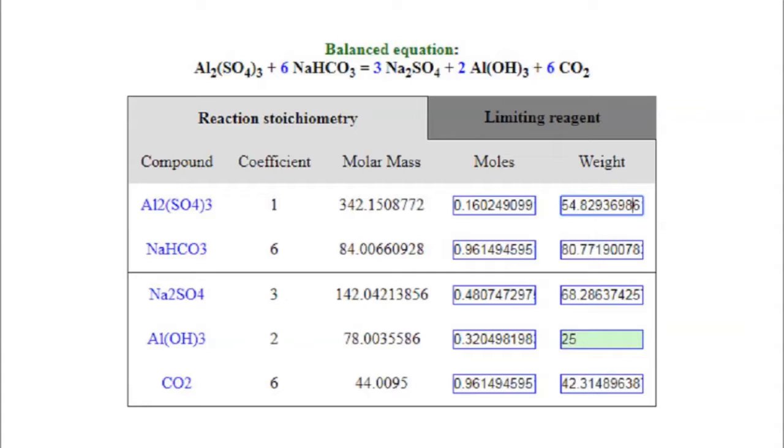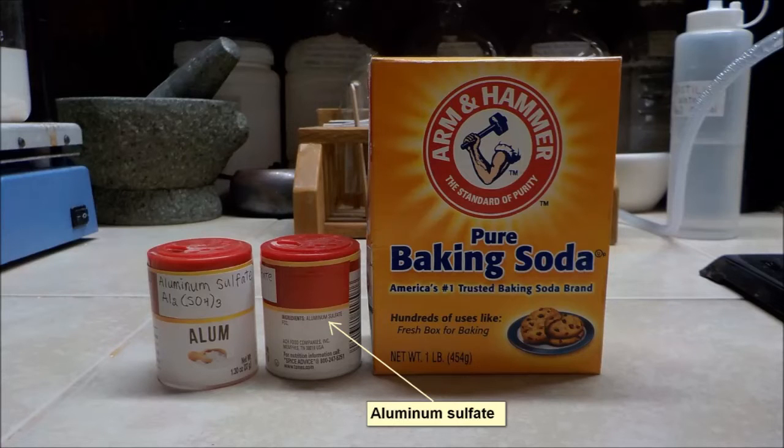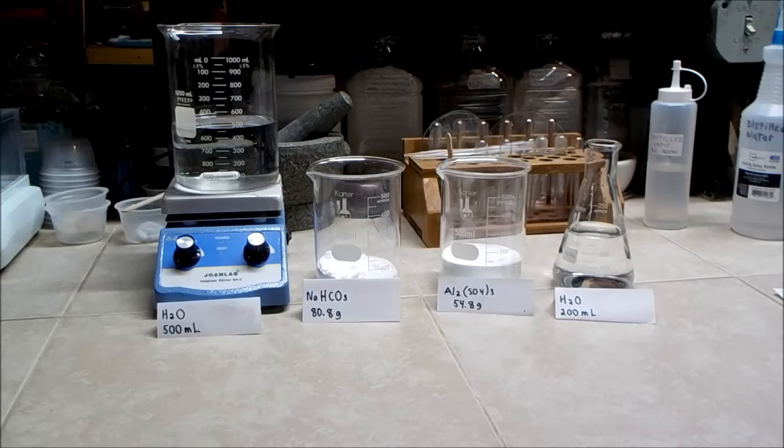Here is the balanced equation, and stoichiometry weights have been adjusted to produce 25 grams of aluminum hydroxide. Here are the actual ingredients I am using in the experiment. This alum was purchased in the spice section of a local supermarket. The ingredients are clearly listed as aluminum sulfate. I have pre-measured both chemicals for the reaction along with some distilled water.